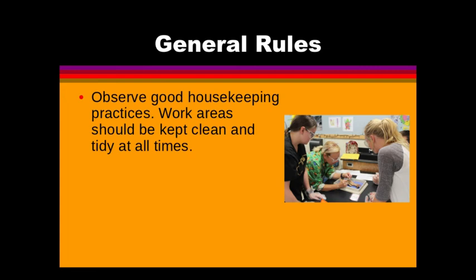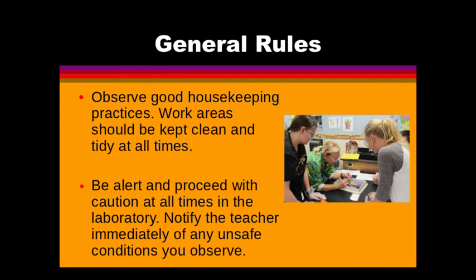So a couple more things. Observe good housekeeping practices. Work areas should be kept clean and tidy at all times. I will set you up so that your workspace doesn't have a lot of extra stuff. When we get it messy, then accidents tend to happen and they're harder to clean up. So I'll make sure I help you with that.